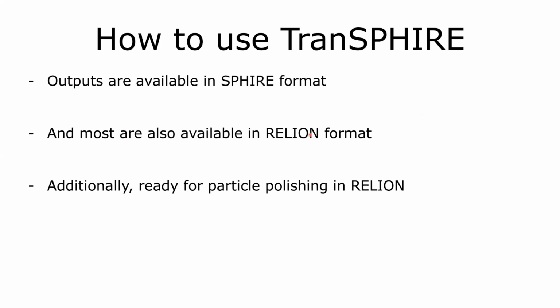It will create a motion corr star file, which can also be used for particle polishing directly, because I copied the mechanism to create the particle polishing metastar files after successful motion correction was running. Those metastar files are created, so you can immediately start polishing after you successfully got a high resolution 3D reconstruction.